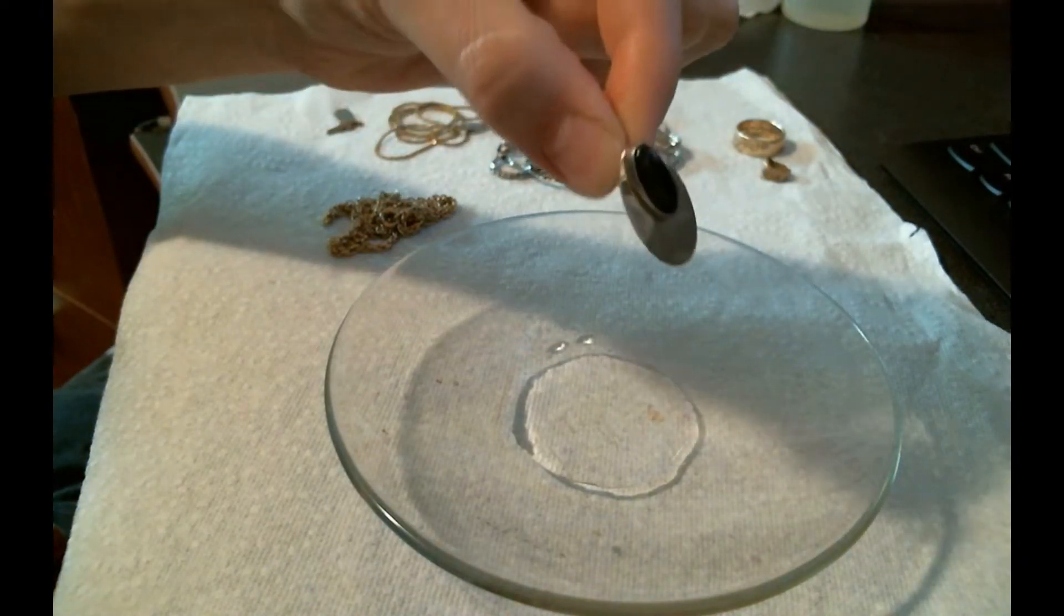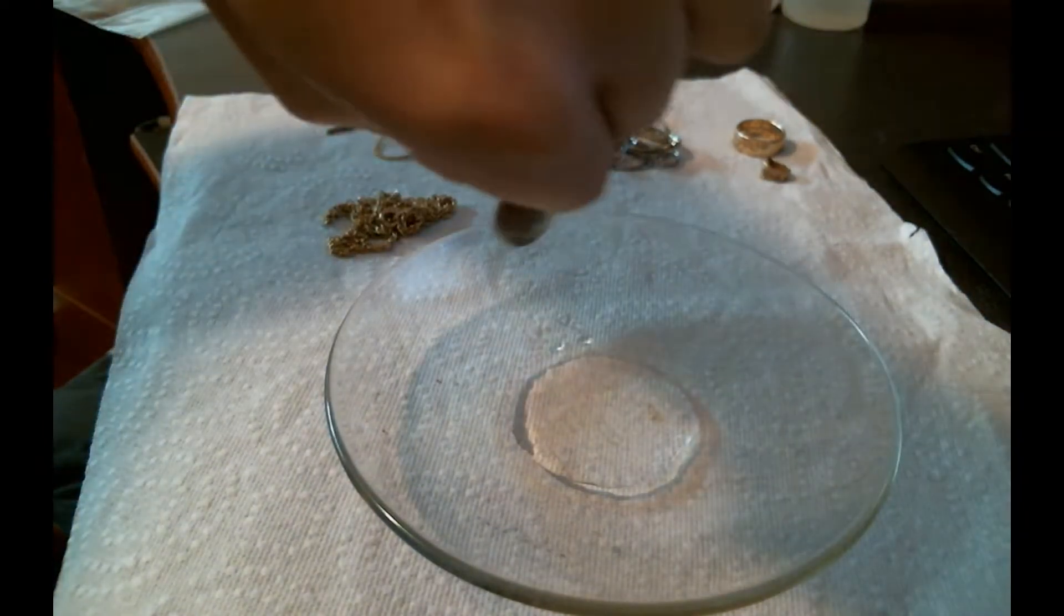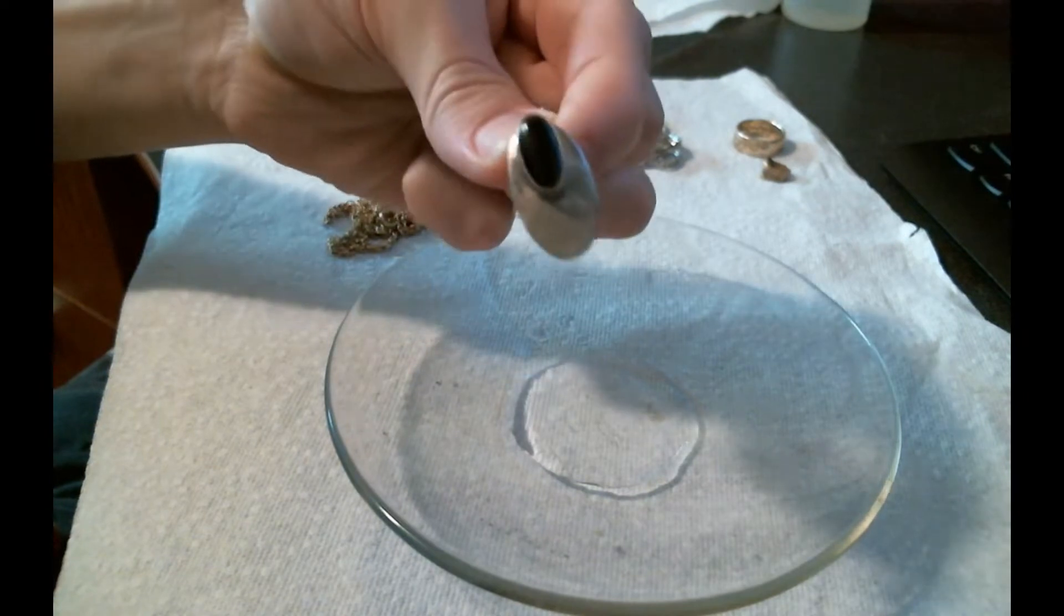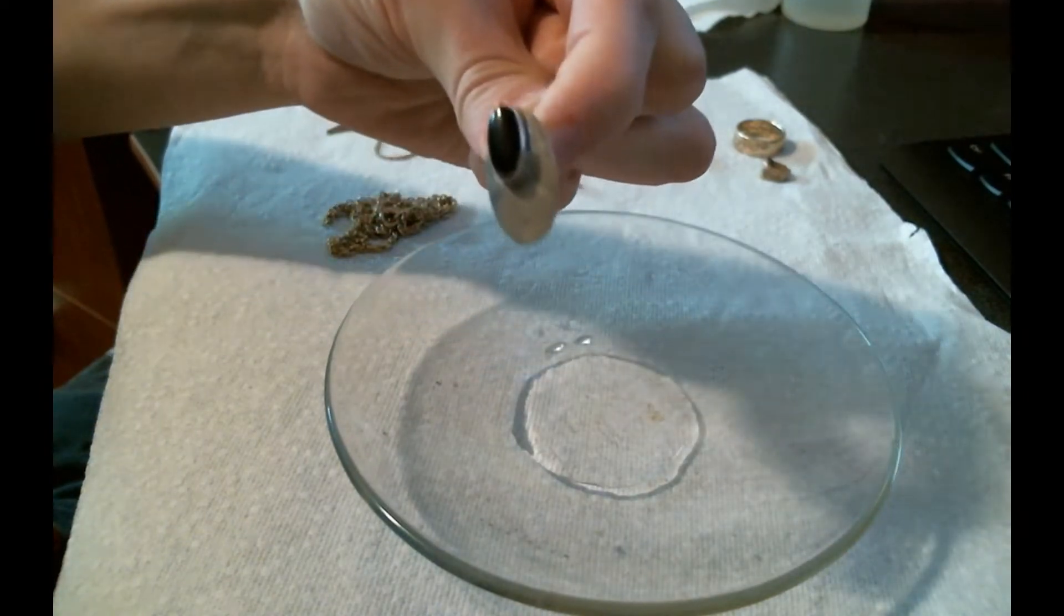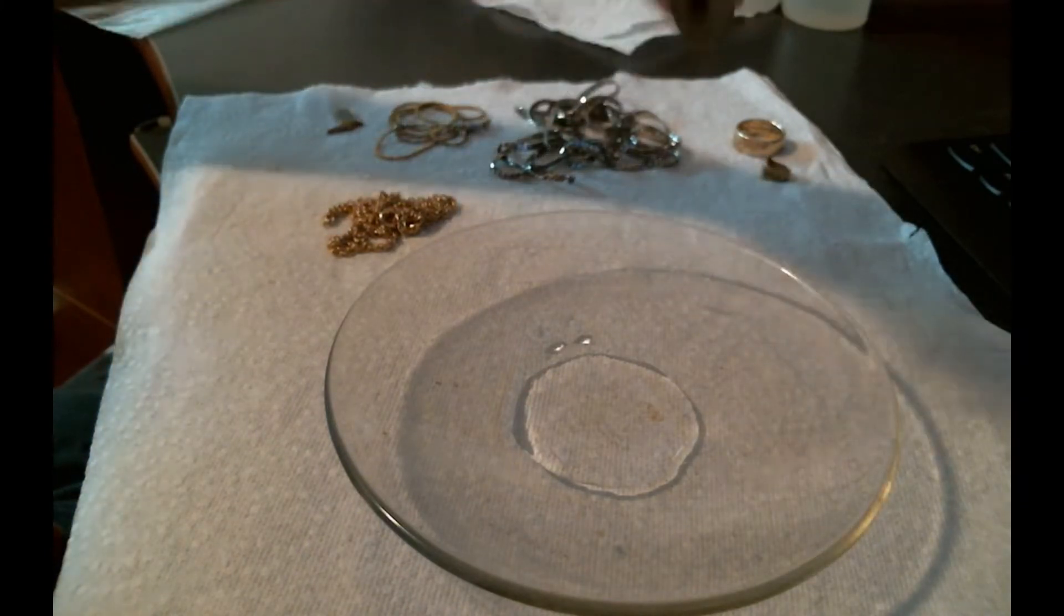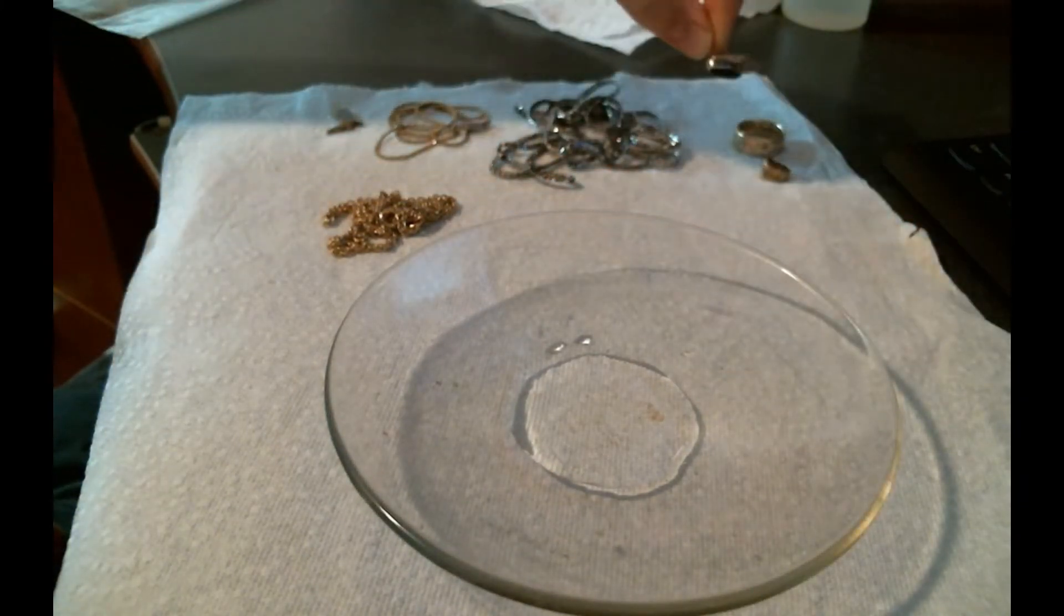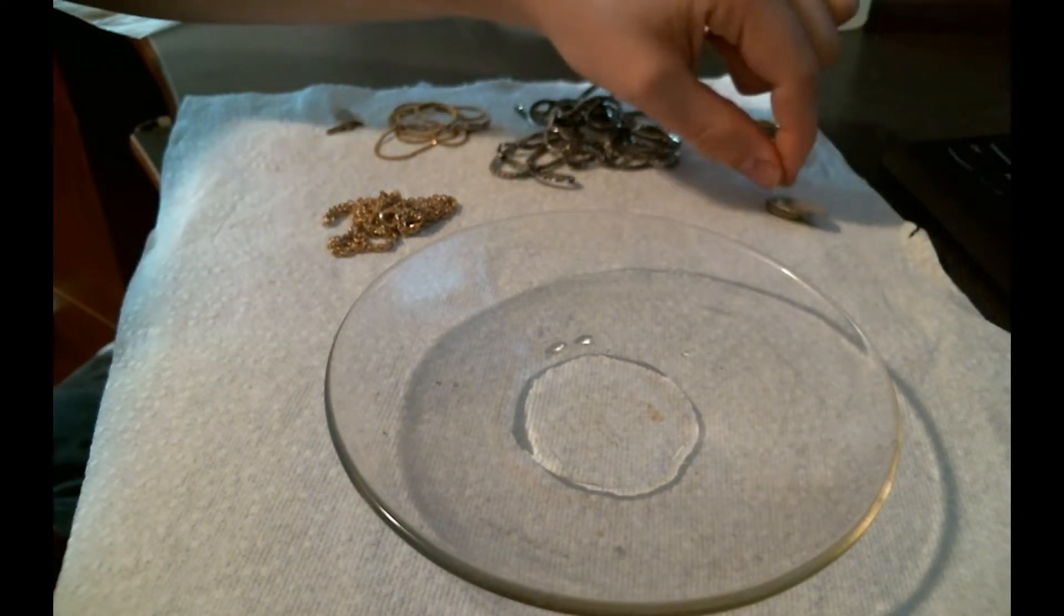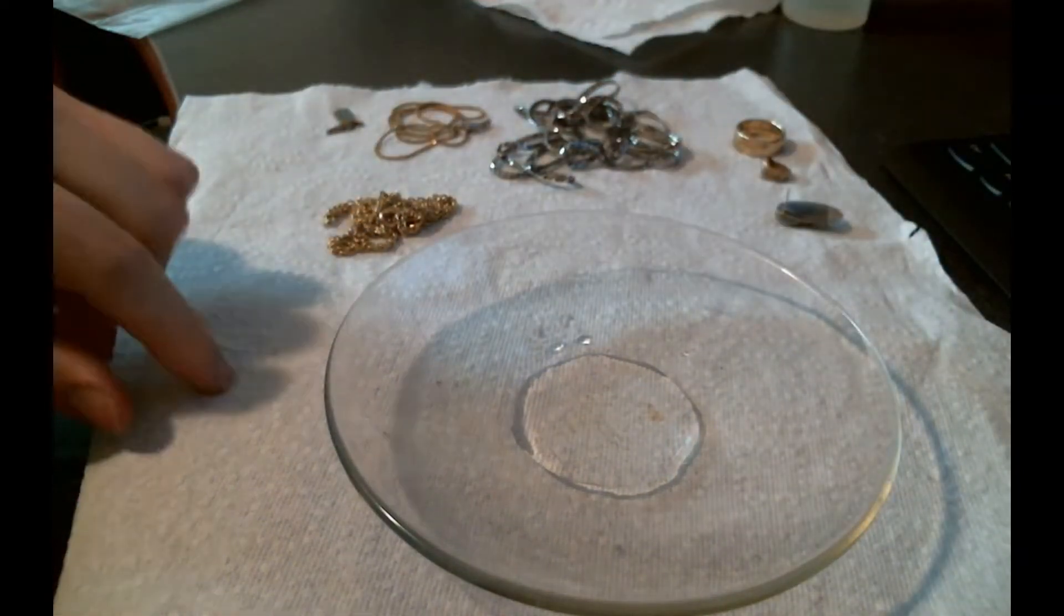That'll ruin any silver jewelry you put in there. Luckily this earring needs to be refined anyway because it's missing its pair. Nitric acid will ruin the finish of silver jewelry, so I usually don't test it. I just look for marks on silver if it has marks.